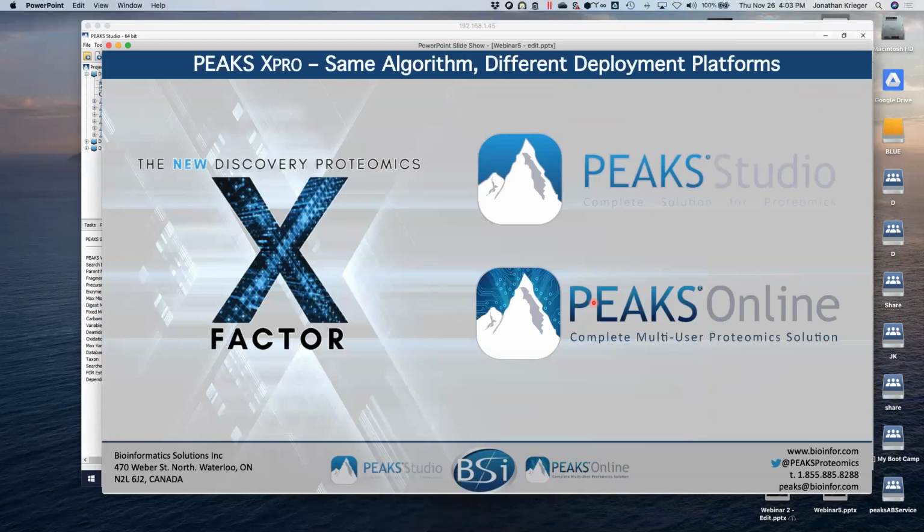Wanted to show that. Depending on which platform you may be using, PEAKS Studio or PEAKS Online, a lot of effort has gone into building these on the same foundation and the same algorithm. PEAKS Online has been developed to take on these large scale projects, which is especially true in the case of timsTOF data because the files are so large. PEAKS Studio is your traditional studio, and I'll focus mainly the talk today on Studio instead of Online. I've done a talk on Online already and showed some of that timsTOF data, but certainly if you are an Online user and want to know more about it, reach out to me.